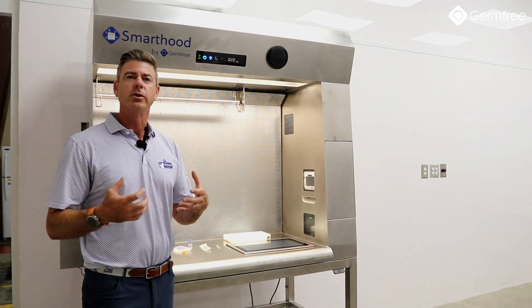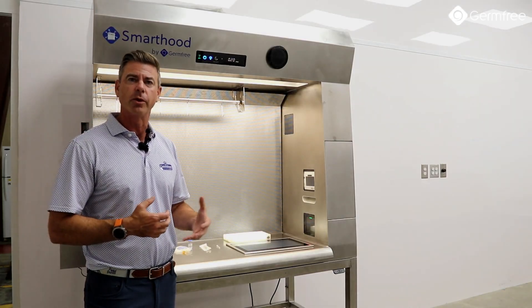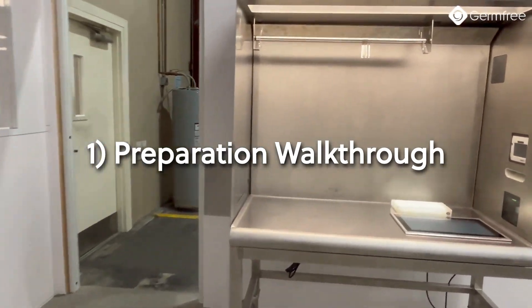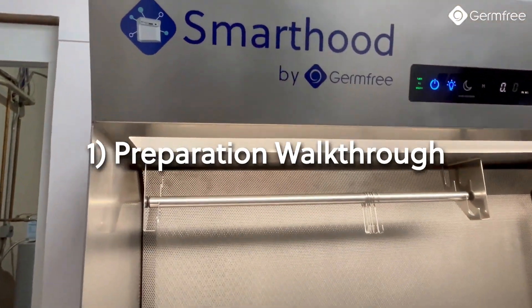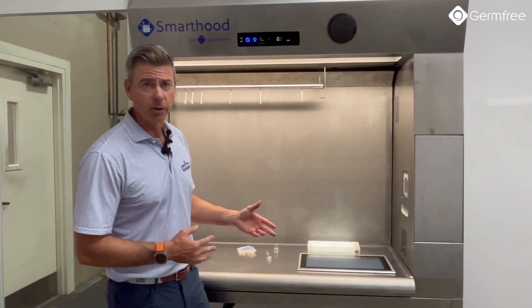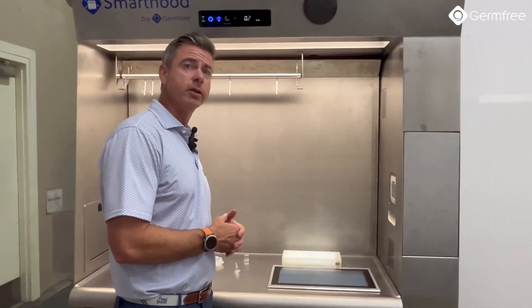I'll take you through the hood and show you how we work with it. Here I'm going to run through a quick preparation using the IV workflow software that we have loaded onto the SmartHood.